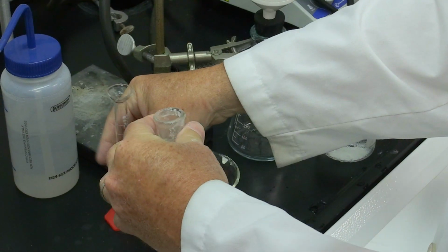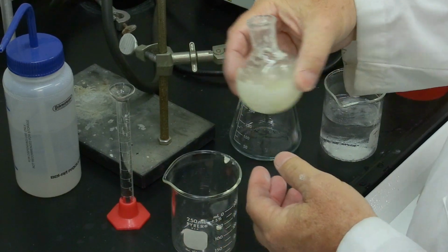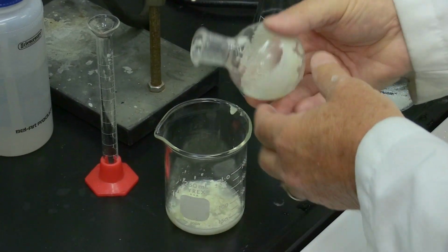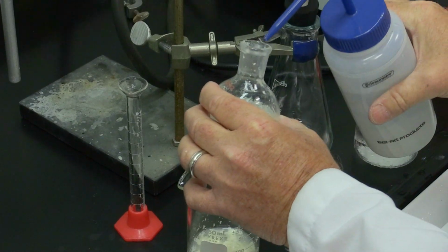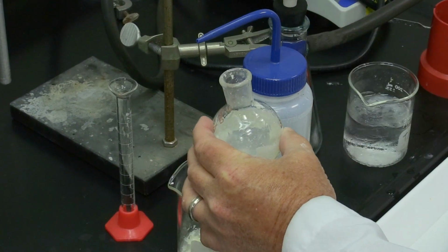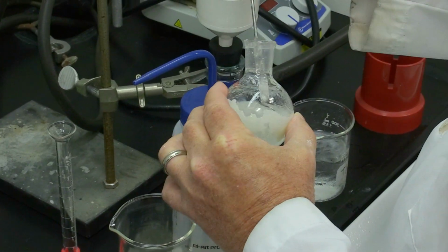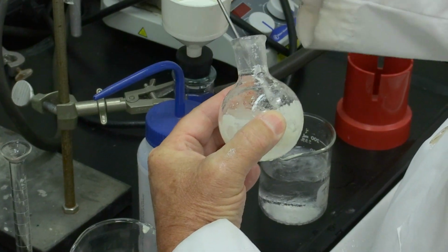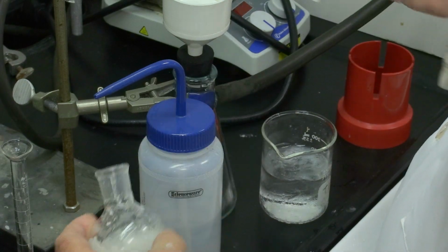Put 10 milliliters of water. Get a lot of it out. We can use a little extra water because we can use that in the suction filtration anyway. And we'll make sure, because we're quantitating this amount, that we get most of it out. We'll see how much product we're able to get.